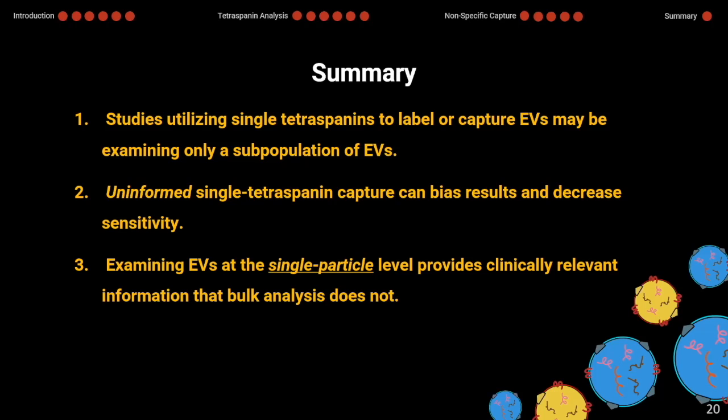Finally, examining EVs at the single particle level provides clinically relevant information that bulk analysis does not. So looking at these different subpopulations and identifying which have good multiplexing efficiency is really important in the diagnostics field. But I think it's also very important to the field at large.